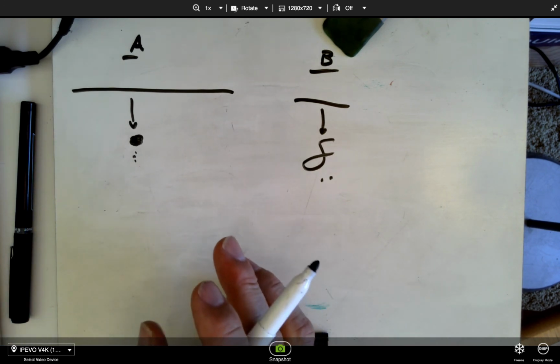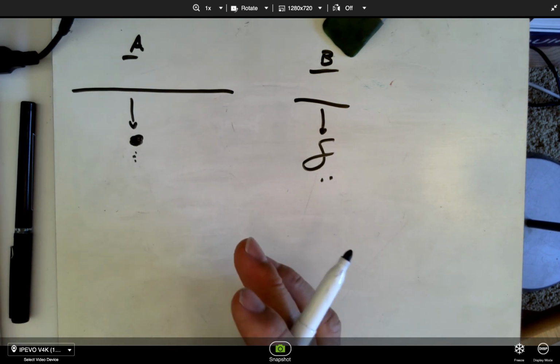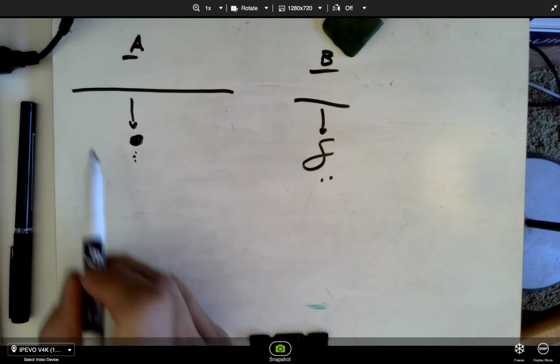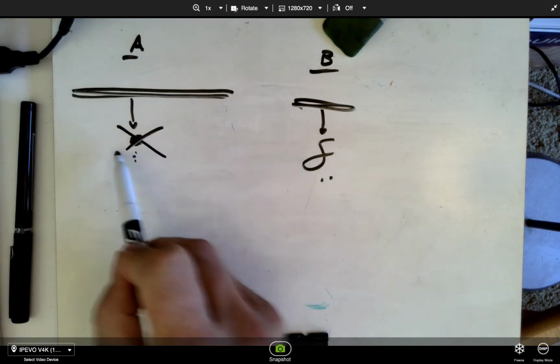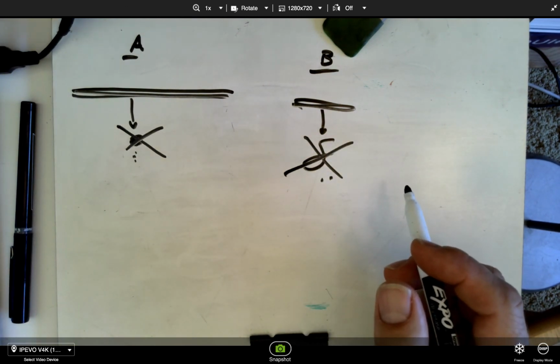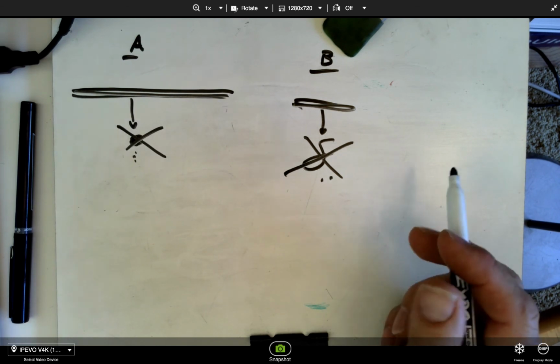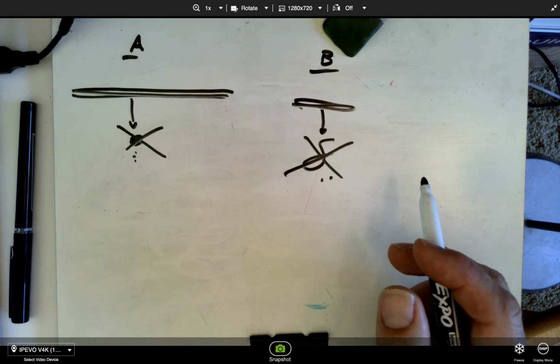So we need to solve a problem. We need to make it so that those proteins run through the gel based on their length, based on their size, and not their shape. Which means we need to get those proteins, no matter what protein we're looking at, to take on the same basic shape. How do we do that?